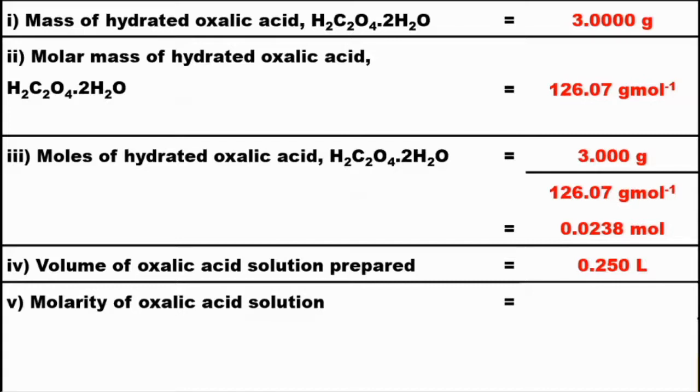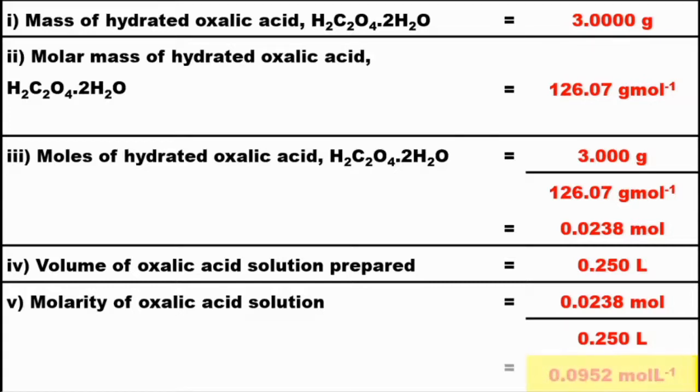Substituting, 0.0238 moles divided by 0.250 liters, and the molarity of the oxalic acid solution is 0.0952 mole per liter, or molar.